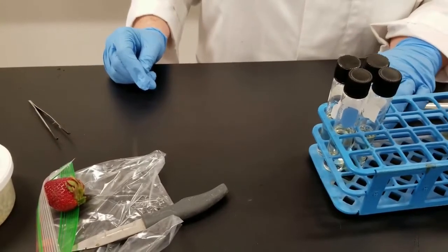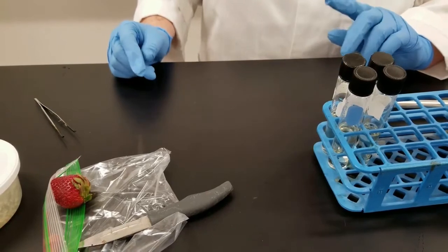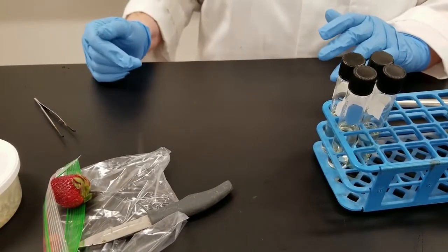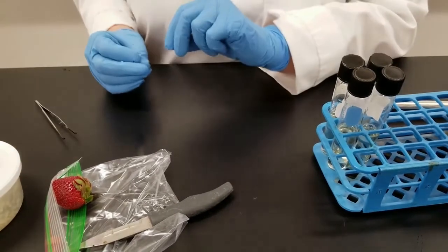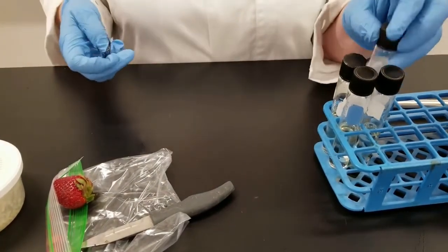Fungi in a broth medium are going to look different than bacteria. Bacteria, you know how when it's growing in a broth it turns very turbid or cloudy. Fungi don't do that. They tend to form little balls, but the liquid portion remains clear. And so that's just another difference between them.